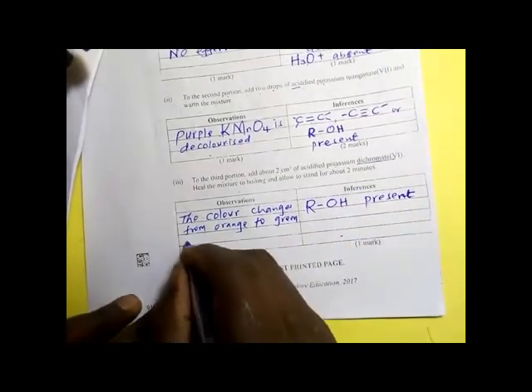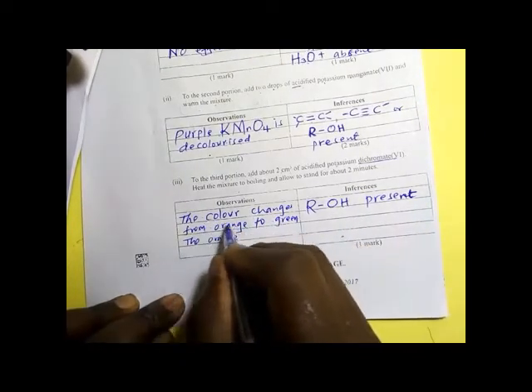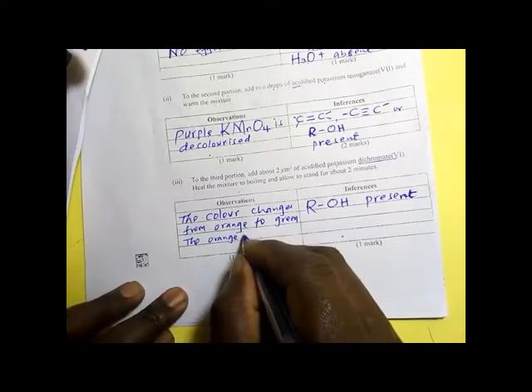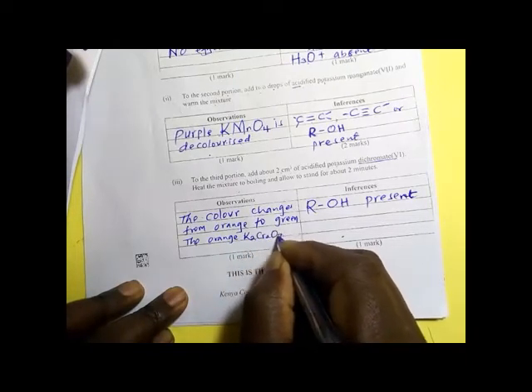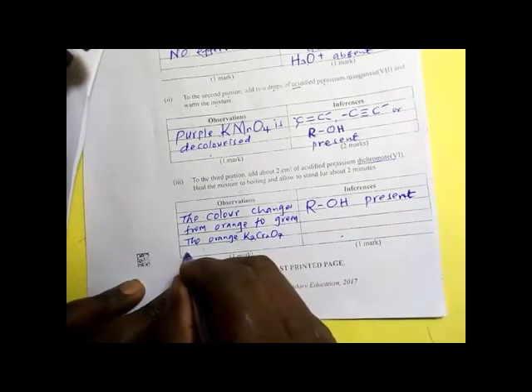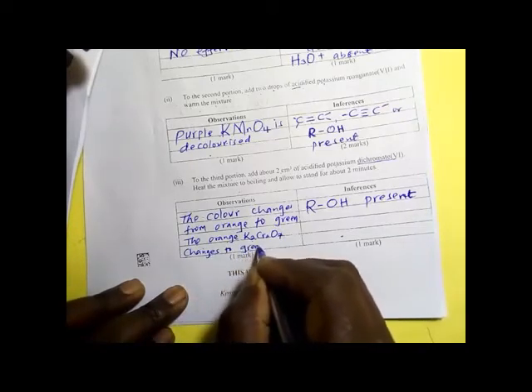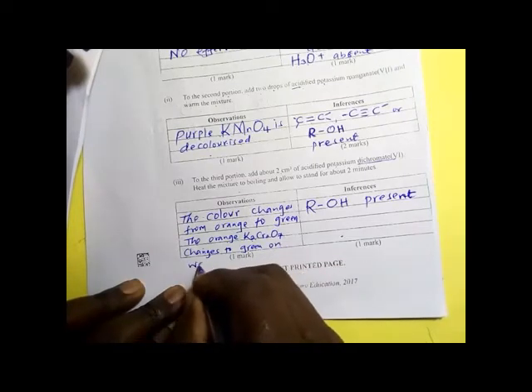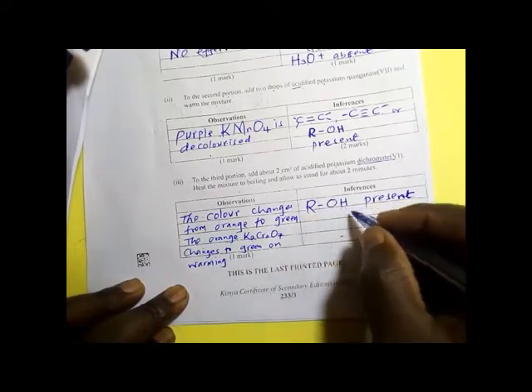You can say that the orange acidified potassium dichromate changes to green on warming. So this one is present.